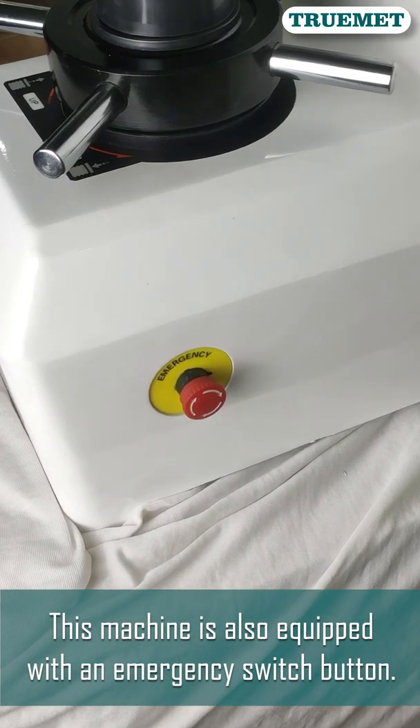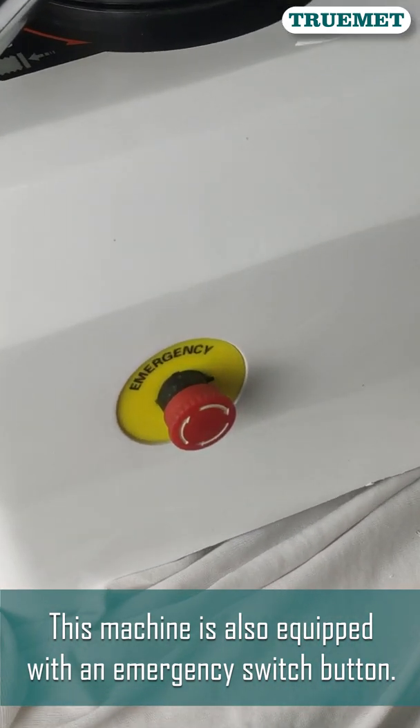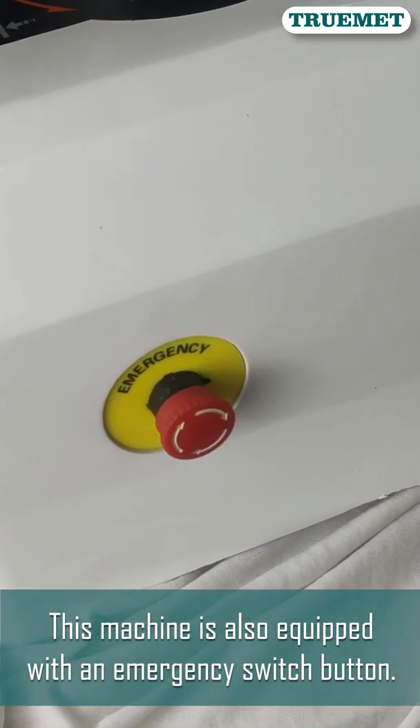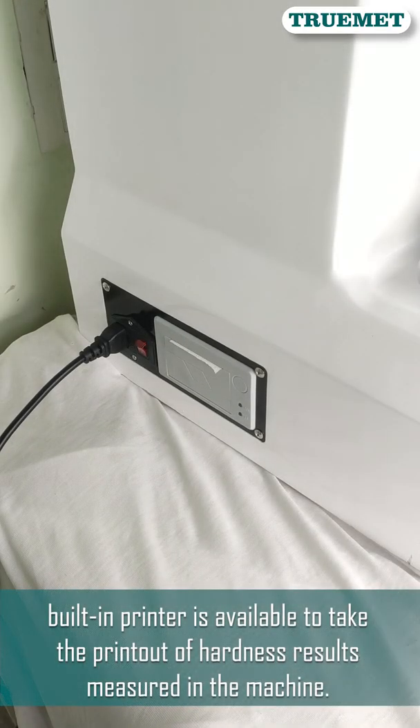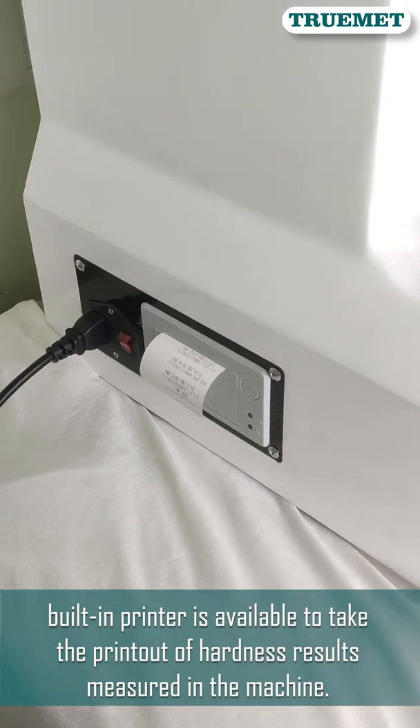This machine is also equipped with an emergency switch button. A built-in printer is available to take the printout of hardness results measured in the machine.